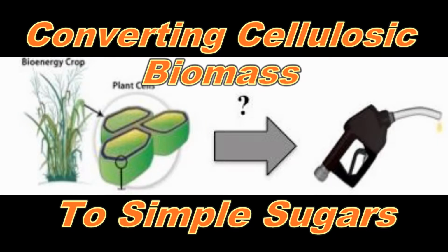Good morning. Welcome to the Converting Cellulosic Biomass to Sugars video tutorial. This video will outline materials required and procedure to be followed when conducting a conversion of cellulosic biomass to simple sugars. First, let's start with some background.